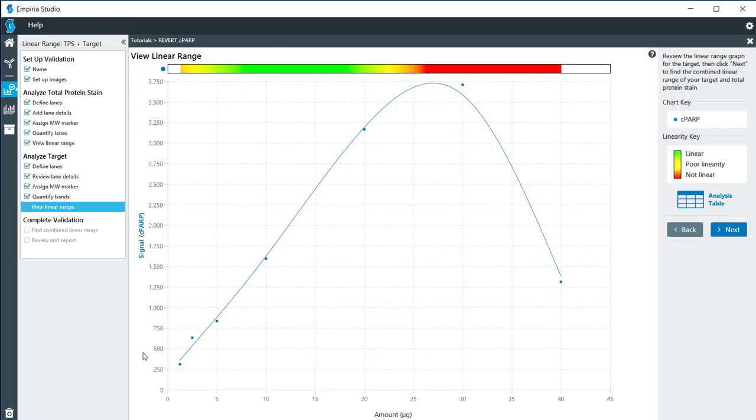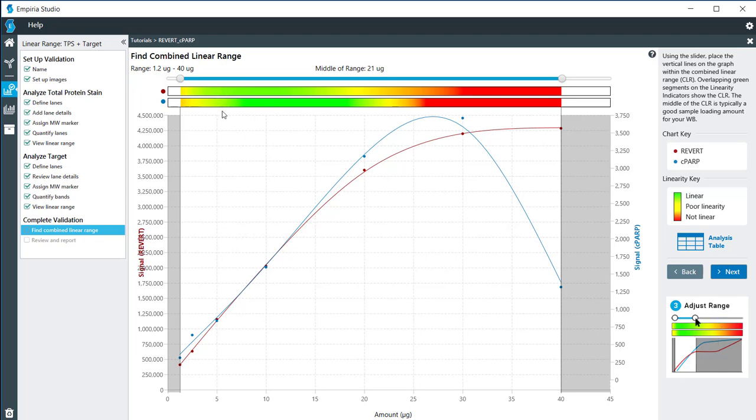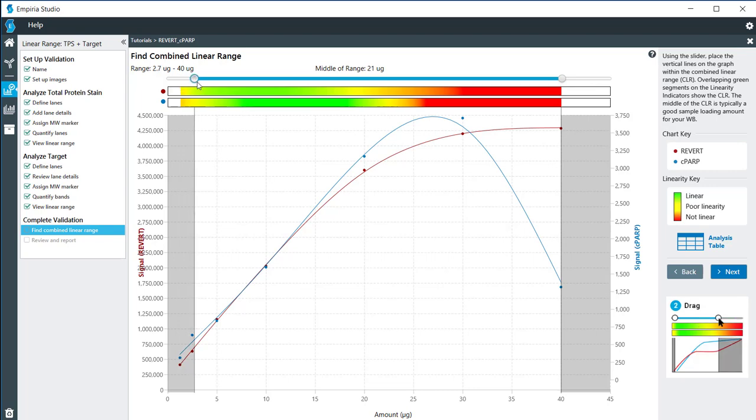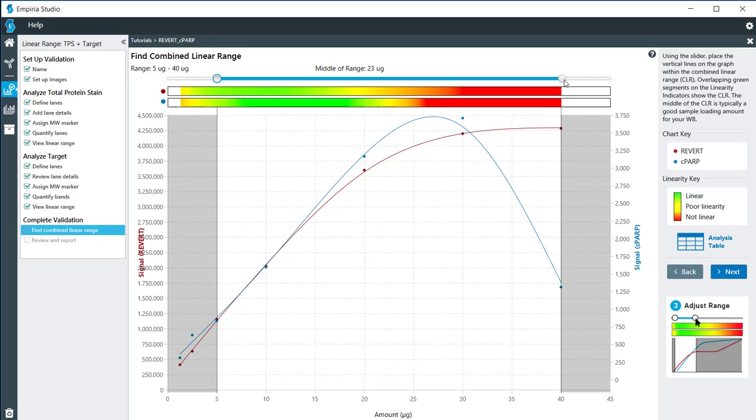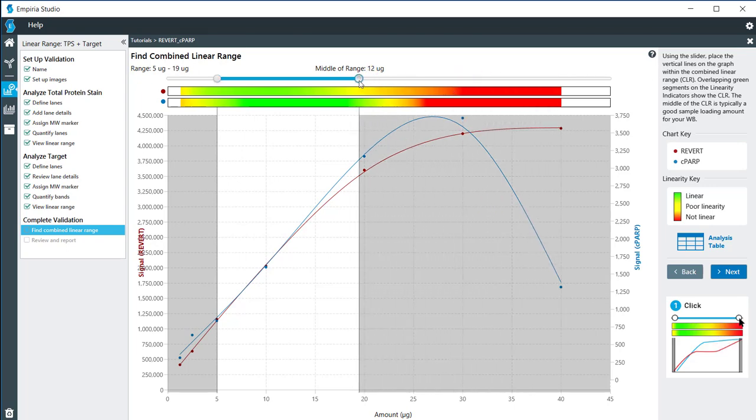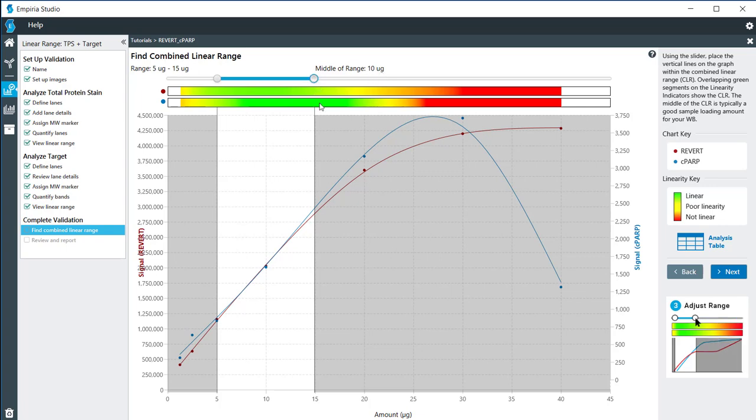Here we have a graph of the loading amounts for my CPARP versus the signal, and we have the optimal linear range right up here on the top. When I click on next we see the combined graph. What we're looking for is where we have the most green in both the revert and the target. You can adjust the line here so that you can determine what is the optimal loading range for both your revert and your targets for this experimental setup. It looks like we have between 5 and 15 micrograms is the linear range where loading 10 micrograms is probably your best option.